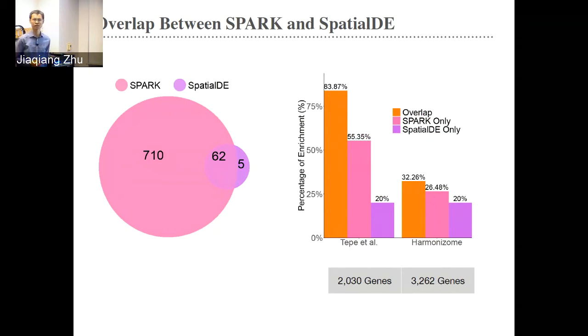Any questions? Well, I have one from online from Dana. They said simulations and real data examples are showing measurements of 10K to 1K genes. Is that due to missing lowly expressed genes, or are there other contributing factors for low counts with either spatial sequencing or seqFISH? How sensitive is Spark to filtering out poorly measured genes? Oh, so if I understand correctly, the problem is more about the filtering.